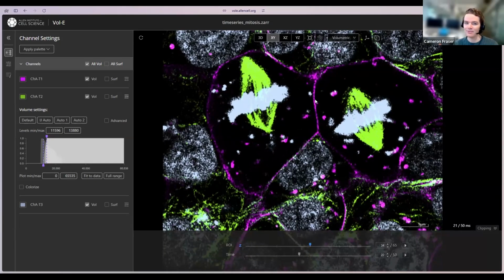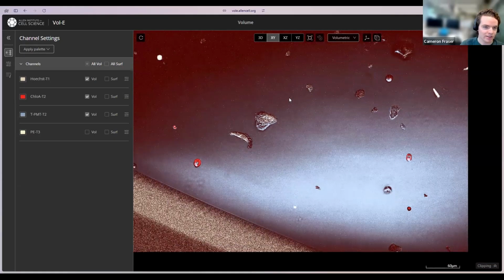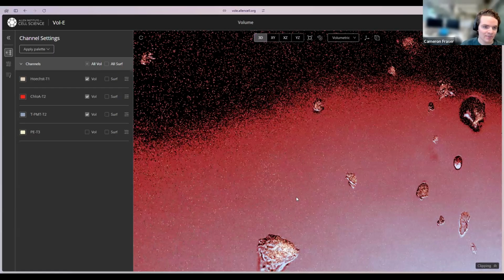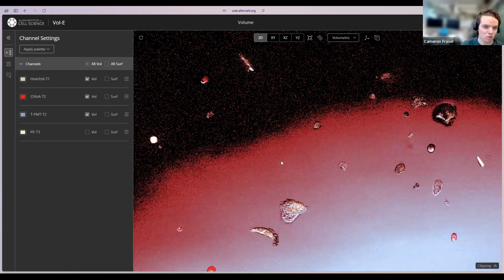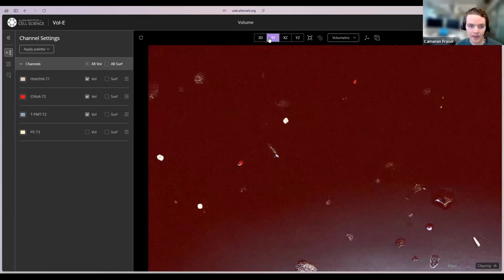Yes, it does. We have external collaborators using it for 2D data. I can show off this image from Cell Painting Gallery, which the natural default is for it to go into XY mode. All you get with a 2D image in Volley is this sort of trivial case of volume rendering where you can rotate around, but you don't see any depth because there's none there.